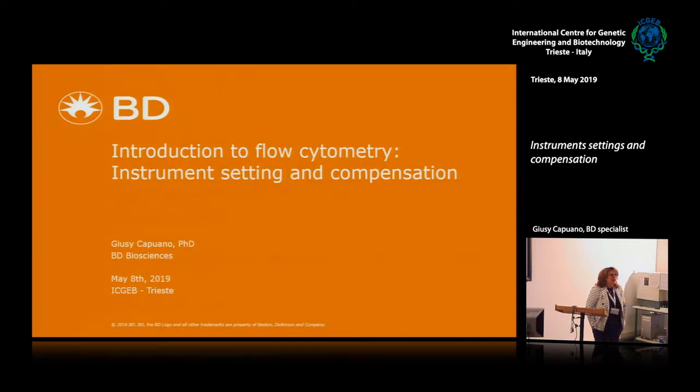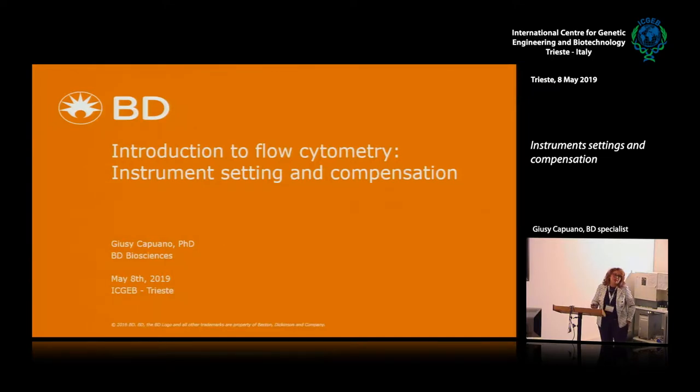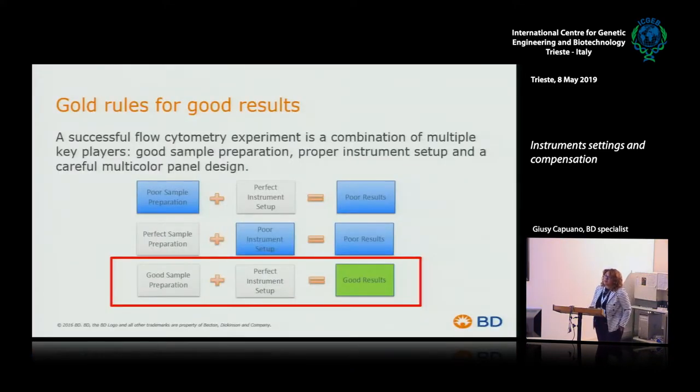I moved from my first experience in a flow cytometry lab as a researcher, and then it became my topic in my job. Today I introduce to you the very first topic about instrument setting and compensation. We start from a consideration.